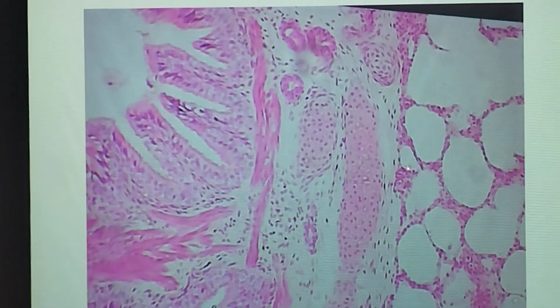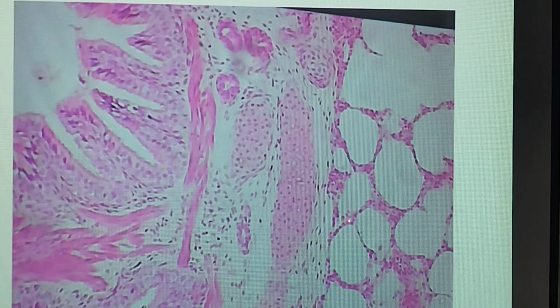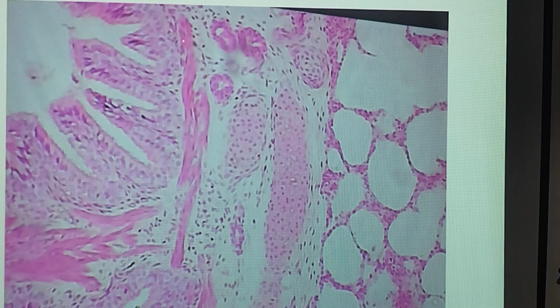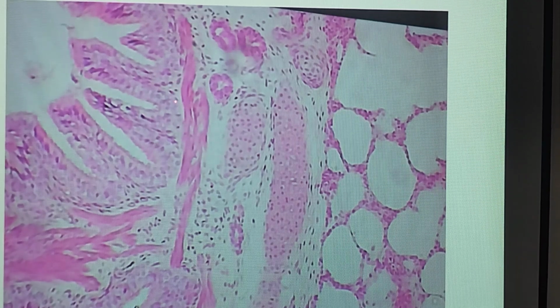So this is a higher magnification. You can see the presence of the alveoli here. These are all alveoli lined by simple squamous epithelium. On this side, you can see the presence of intrapulmonary bronchus. So how do you differentiate the intrapulmonary bronchus and bronchiole?